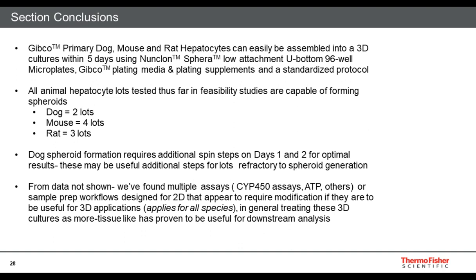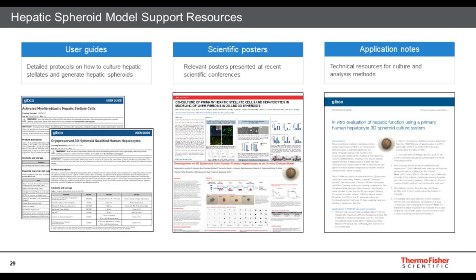And then data we're not showing, what we found is that there are multiple assays or workflows that have been designed for 2D that we found require modification to be used for 3D applications. So this is definitely something to keep in mind across all species as you're doing more and more work in the 3D area.